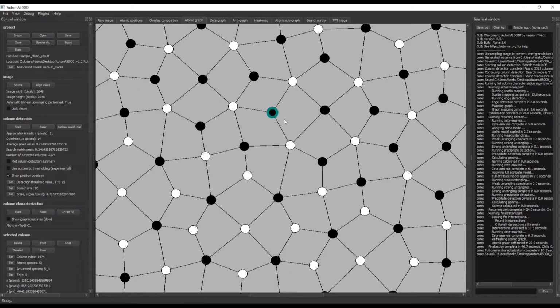In the aluminium, magnesium, silicon, copper system, silicon and copper take on 3 opposite plane nearest neighbors. So you see here, this is either a silicon or a copper. I don't know which one it is. Looking at this graph, I just see that it has 3, and then I know it should be silicon or copper. But to distinguish between silicon and copper, we of course rely on the contrast brightness.